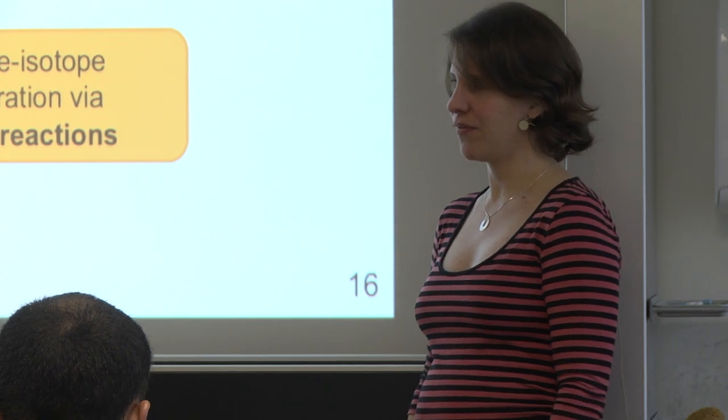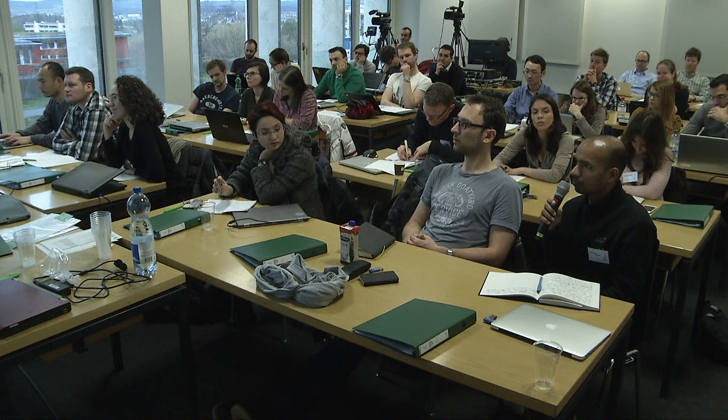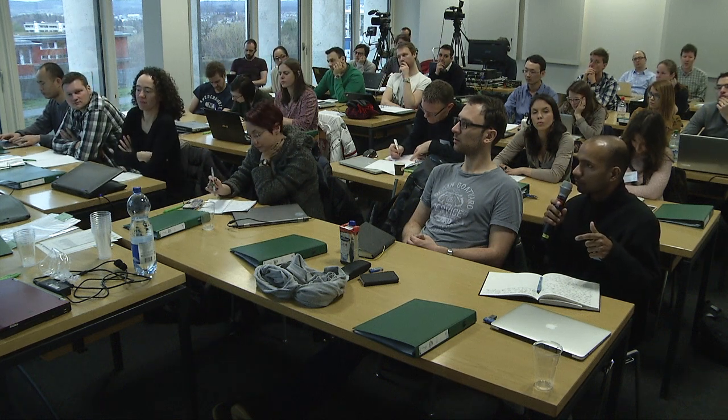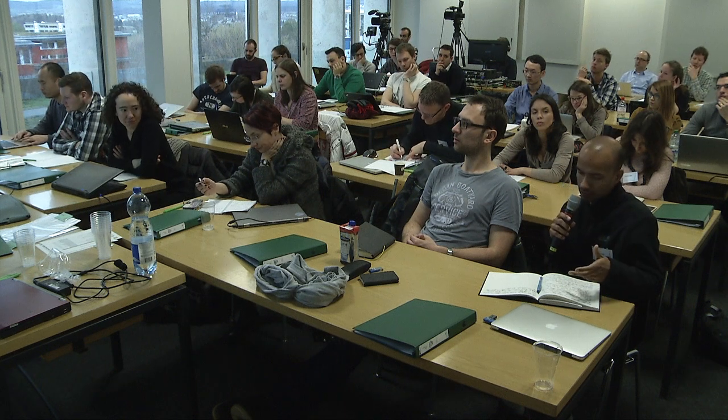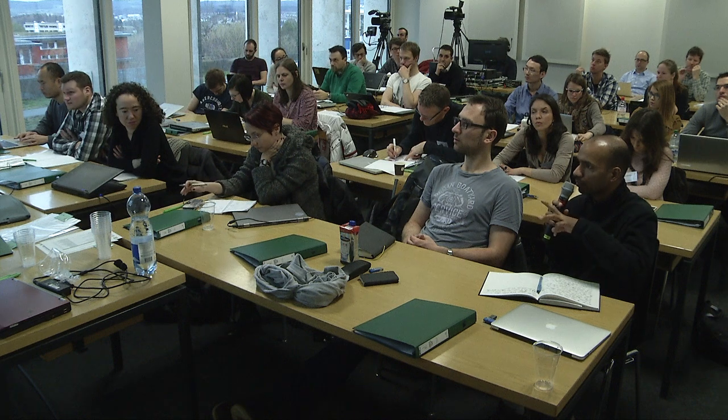Okay? Just had one more question. Yeah, go ahead. You mentioned yesterday that instead of purchasing a labeled peptide, you actually grew up yeast in 15N label, and then you mixed it in a 1:1 ratio with your sample. Now, can you do that if you have, say, a eukaryotic cell, human cell tissue culture?